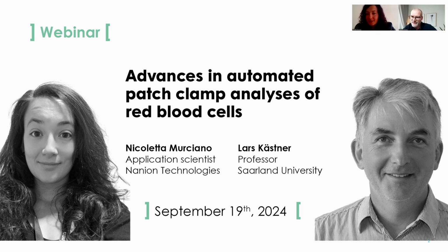So yeah, slide 7, it's where I show basically the difference between Piezo1 and Piezo1 plus TRAM34 in the different samples: erythroblasts, reticulocytes, and red blood cells. So I would expect TRAM34 to block in red blood cells as well. But as I speculate, this can be related to the decrease of copy number of the channel.